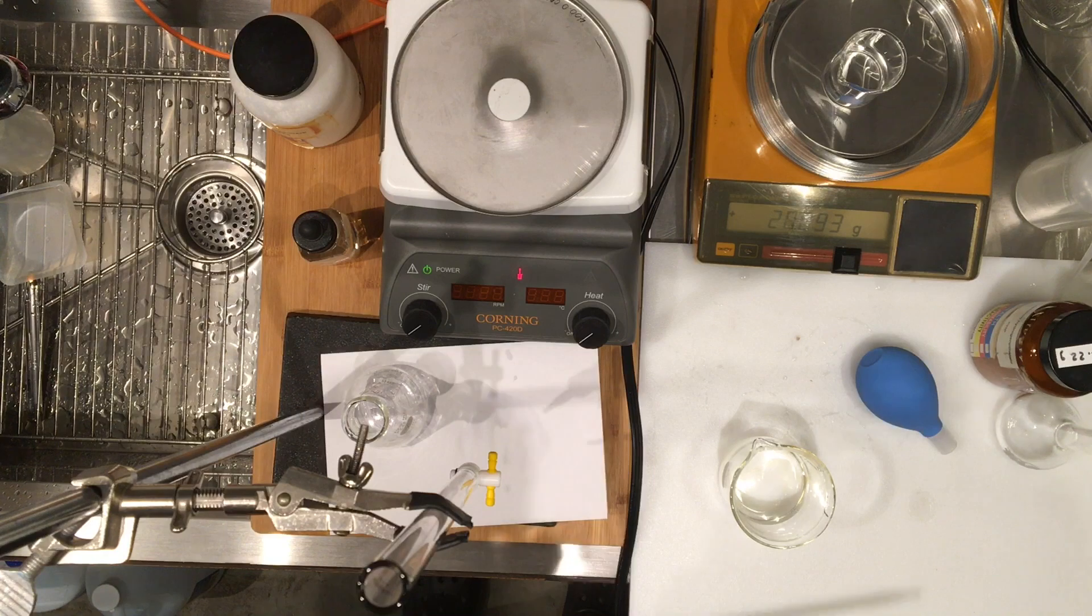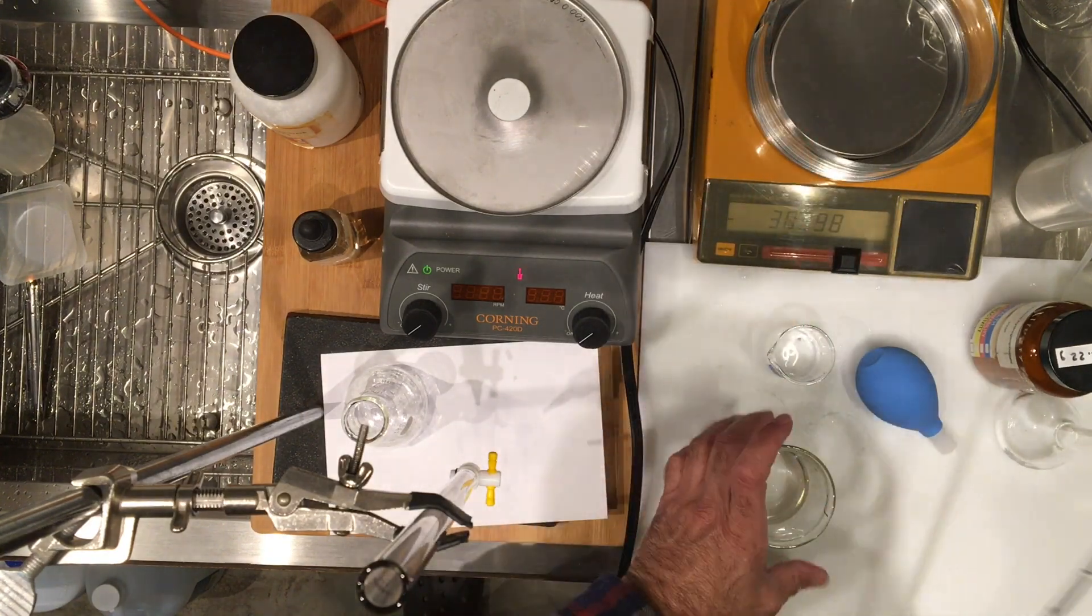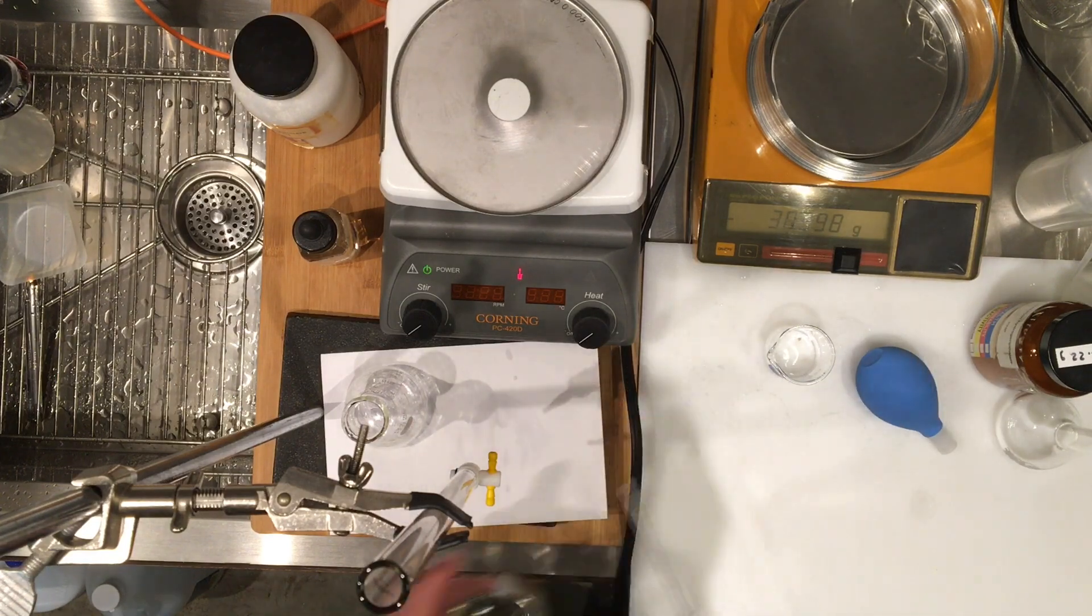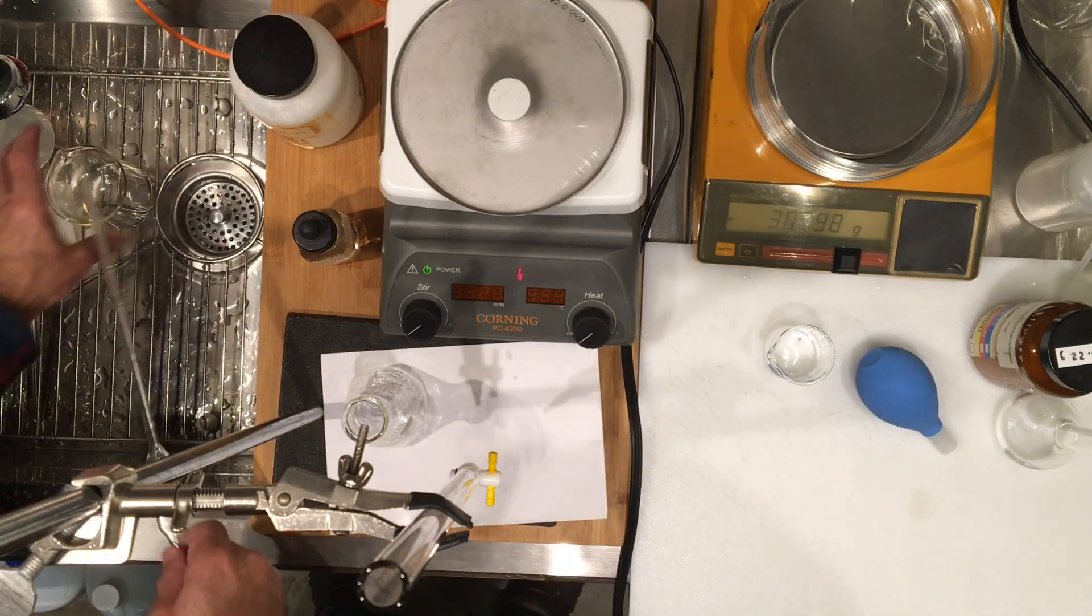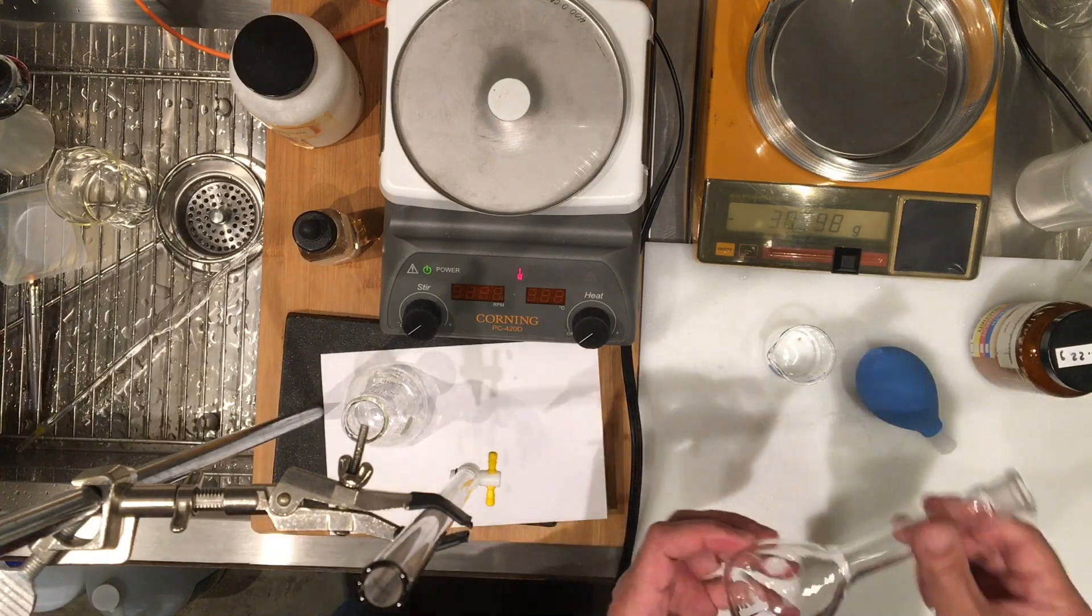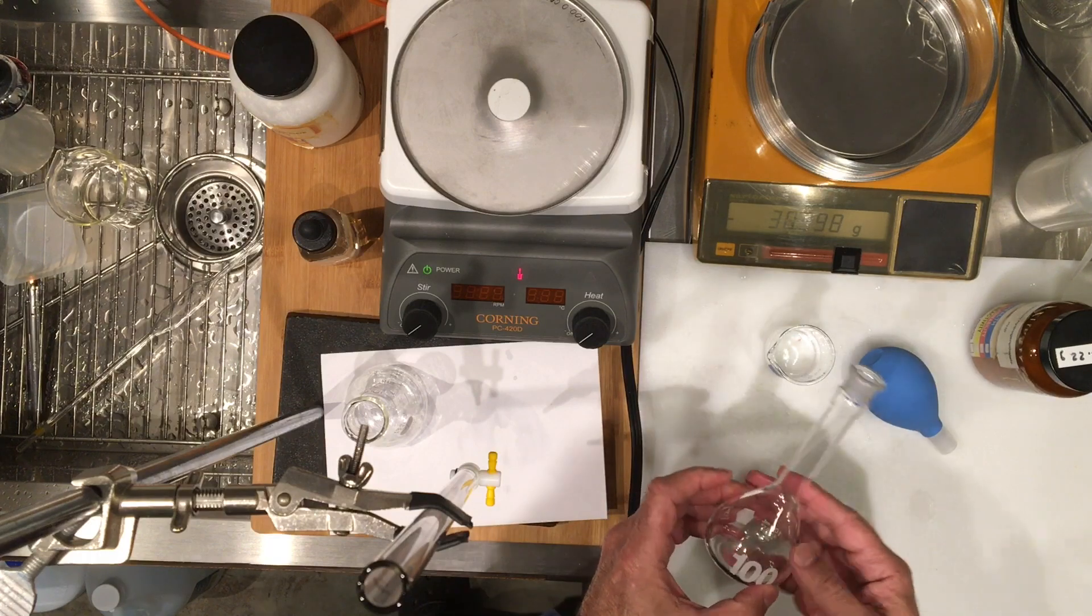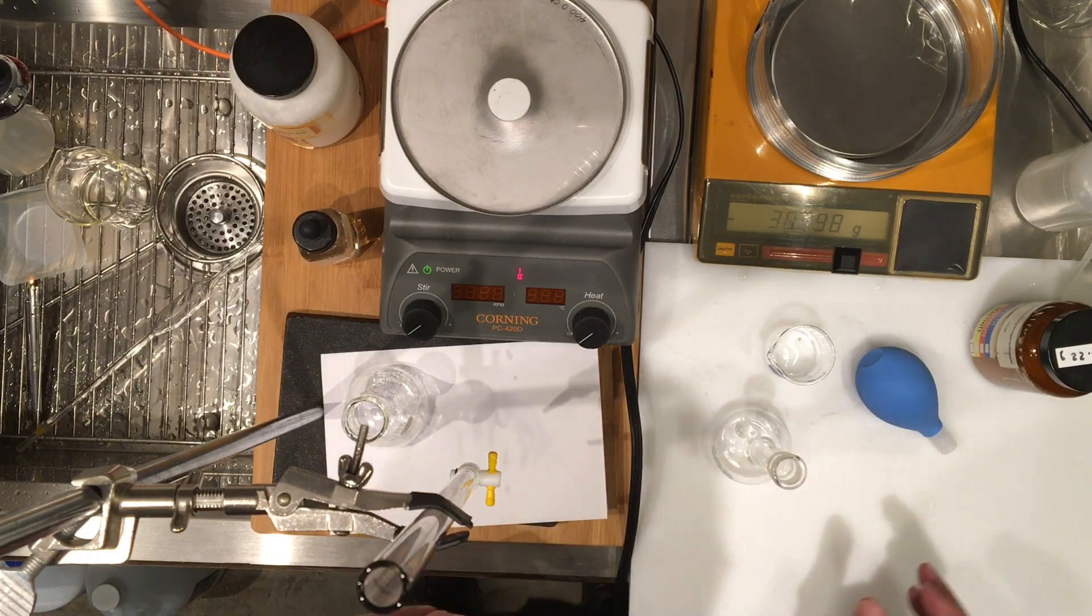So, we have this mass now, we're going to take this mass, or the 20 milliliter, and we're going to transfer it to a clean, and not necessarily dry, because I'm going to be adding water, a 100 ml volumetric flask.